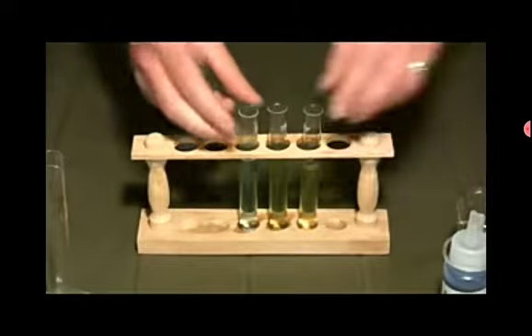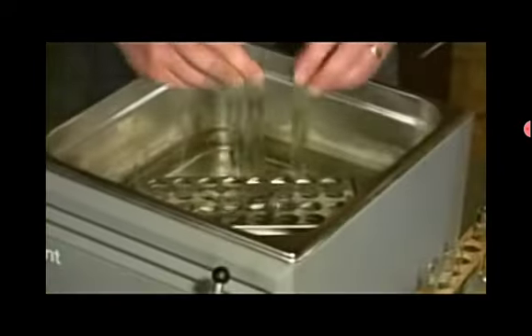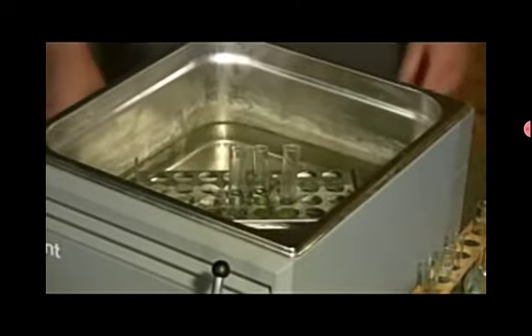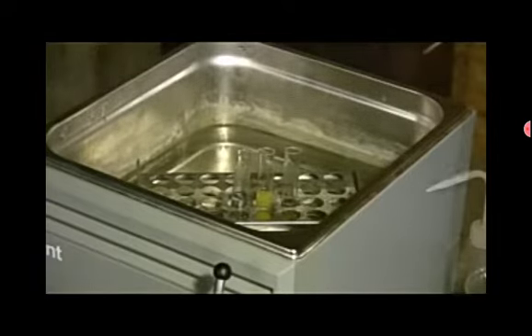And we take those test tubes and put them in the water bath for a few minutes. So we know why we are putting it in a water bath.